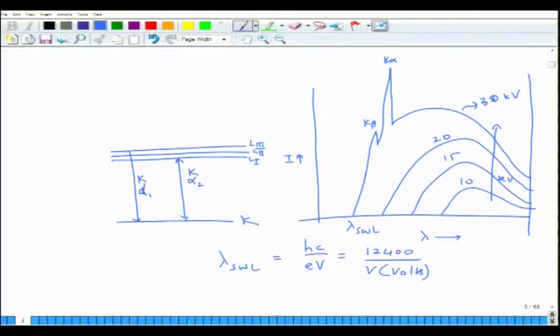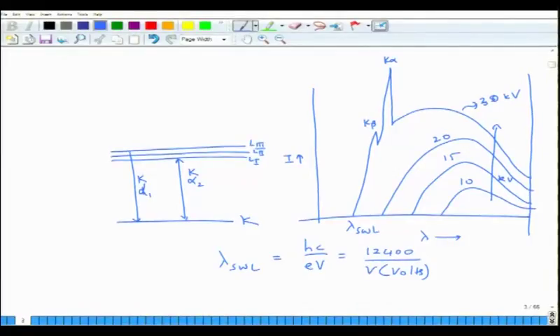So, that K electron gets emitted, it goes out of the material, okay, and as a result you have a transition from the higher level. So, the whole idea in X-ray diffraction is to use these characteristic radiations. Typically we use K alpha radiation for X-ray diffraction analysis because K alpha radiation has a wavelength which is comparable to lattice parameters and it has a very high intensity. So, you do not have to go to very high kVs to achieve good signal to noise ratio.